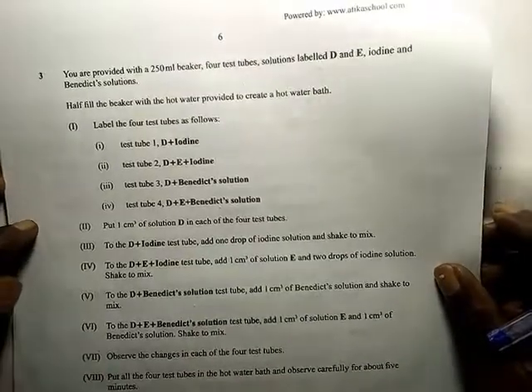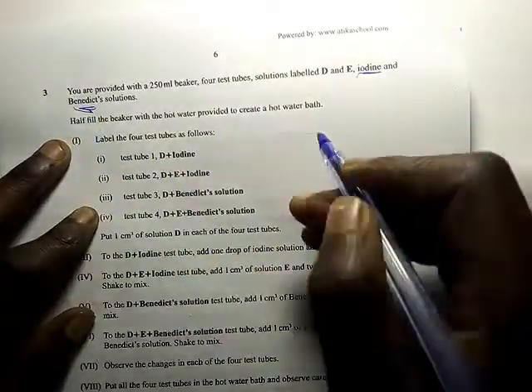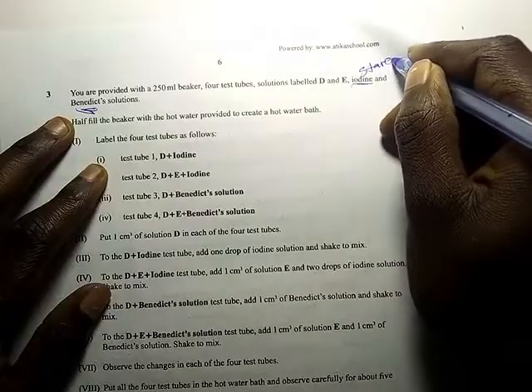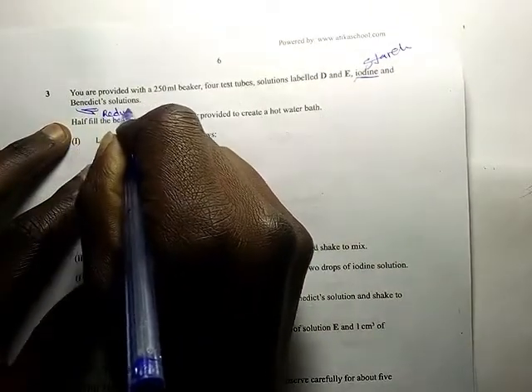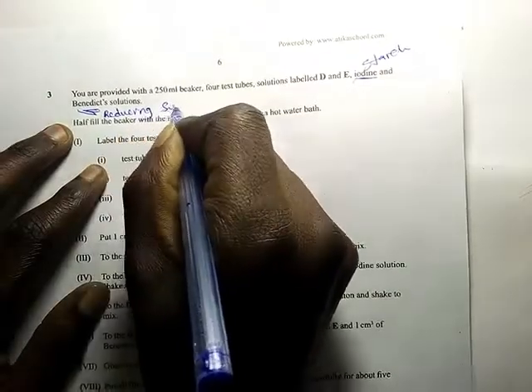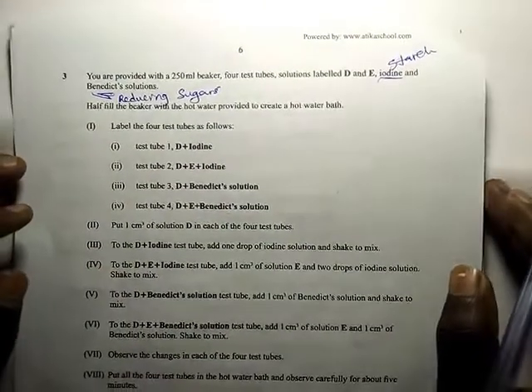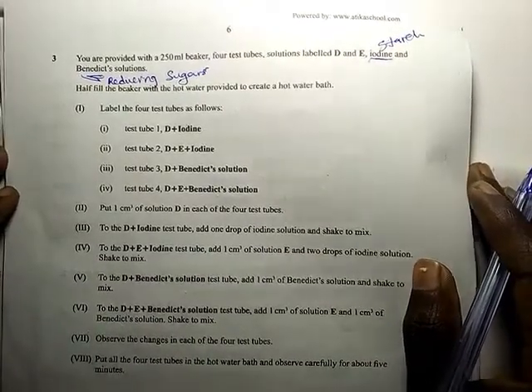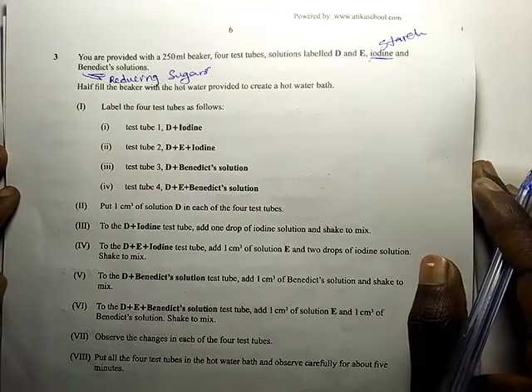First of all, you should be able to know what the reagents you are provided are used to test for. Now, iodine is used to test for starch, Benedict solution for reducing sugars. Now we read the procedure. Half fill the beaker with the hot water provided to create a hot water bath.